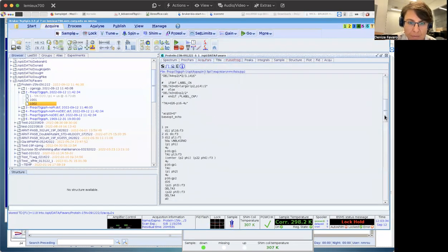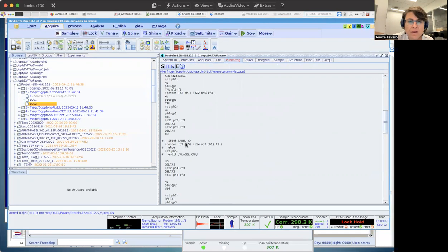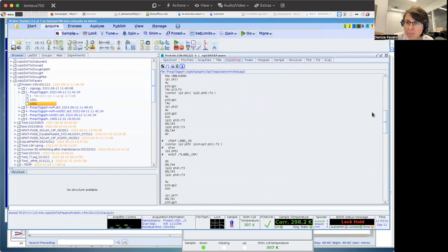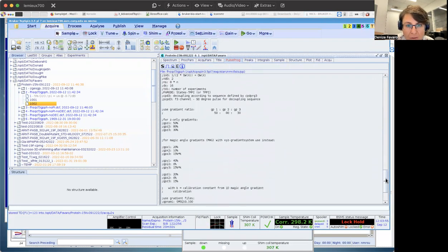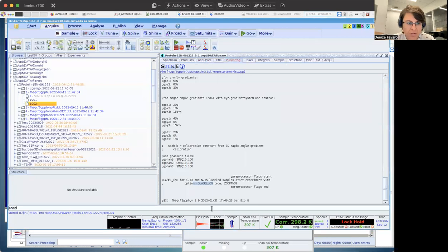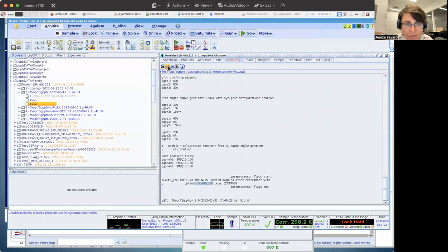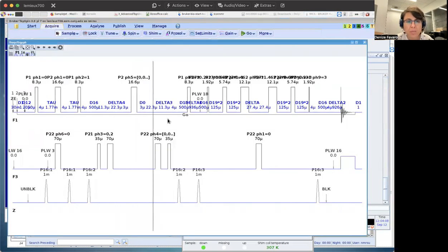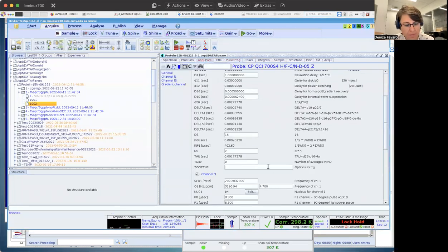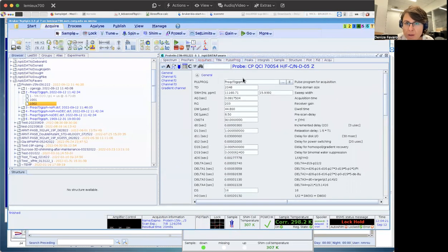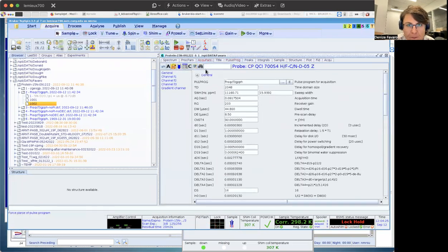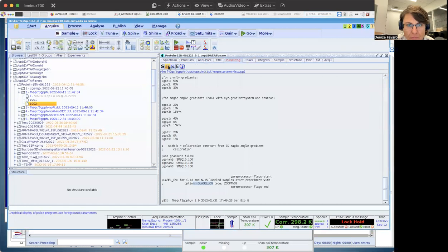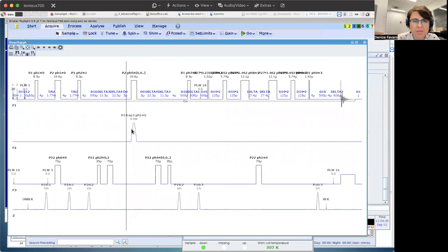You see here that I have some if statements on the pulse sequence. It means if you have a labeled sample, carbon and nitrogen labeled sample, you also need the P14. What I mean is, you also need a pi pulse on the carbon channel. And how do I do that? I just have to introduce this so I can copy and introduce this over here. Before putting here, just let me show you. This is my pulse sequence now. What happens when I put this here? Yeah, something changes, right? I have now another pulse, another pi pulse, and this pi pulse is in the carbon channel.